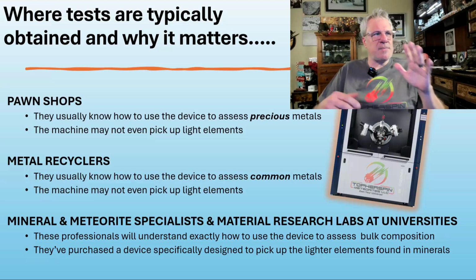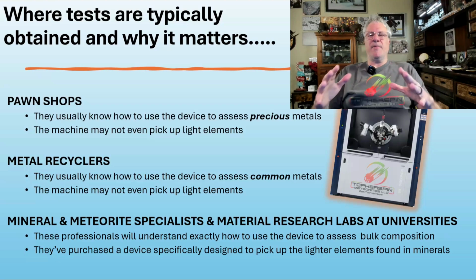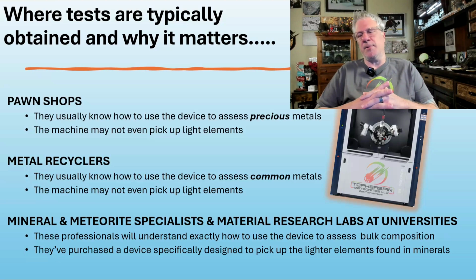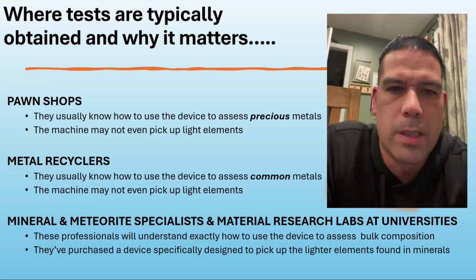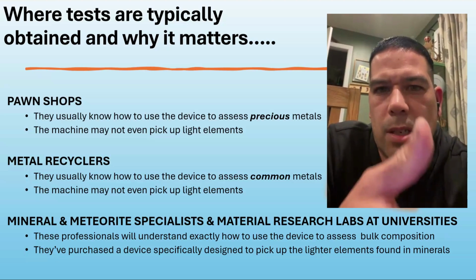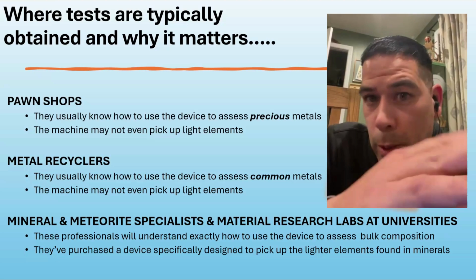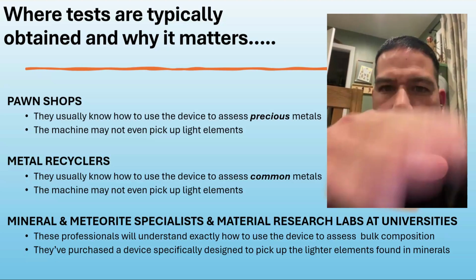Mike, let's expand on that false reading thing. If this is an accurate device, how are we going to get a false reading of 3% gold in my sample? Certainly. So what the device is doing is it's sending a primary X-ray beam at the sample, and then it's exciting the sample, and secondary X-rays are being produced by the material. The device then has sensors that read those secondary X-rays and run them through different spectra that they're looking for, and they're looking for peaks at different points in the energy spectra, right?